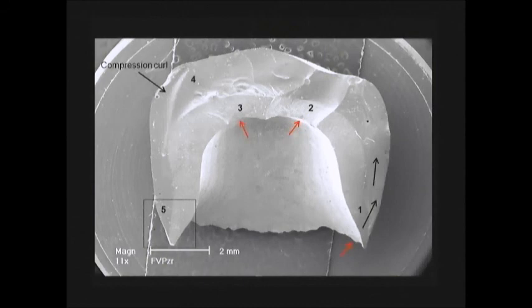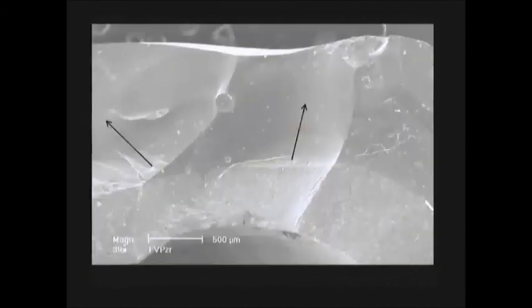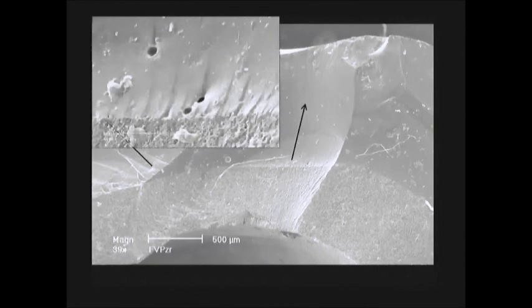the crack moves up. So if I see something here, I go right away to the other end. I want to know. I need evidence that it goes outside to the left. Or if it goes up here, then I have two origins. I have two margins from which it failed. And lucky me, a beautiful wake hackle that moves from inside outside. So then you just become more fancy and you try to see, okay, the direction is here, the direction is here. I can zoom this area here. I have all the evidence I need.